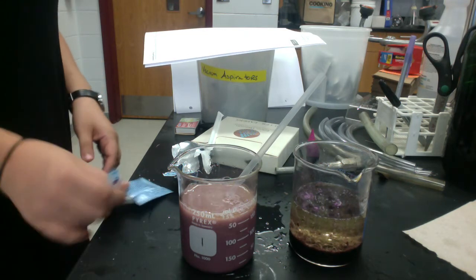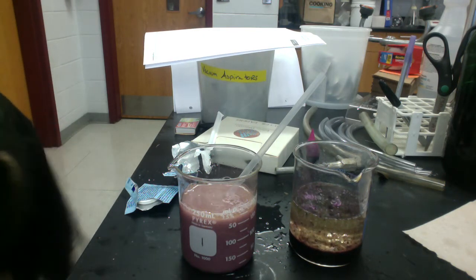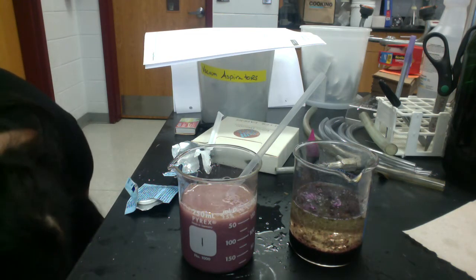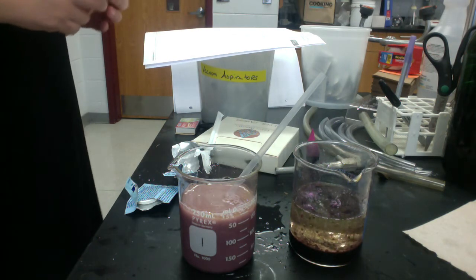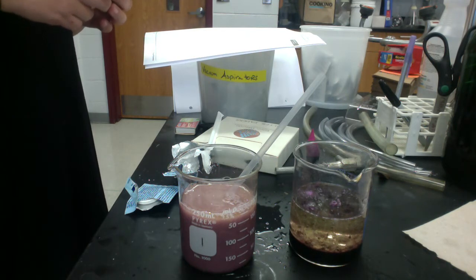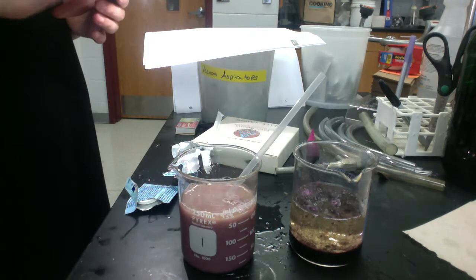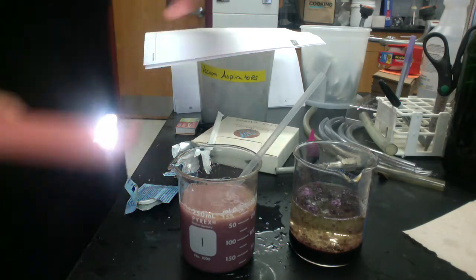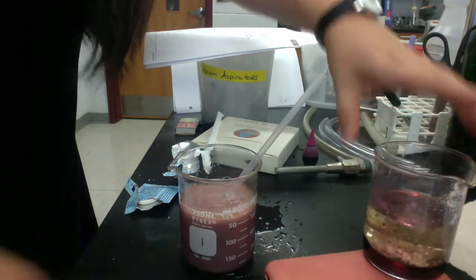So it says use my cell phone or a flashlight, which I don't have a flashlight on me, so my cell phone. Shine a light underneath beaker 2. Okay. So what I think it wants me to do is this.